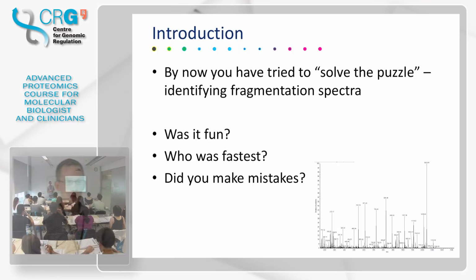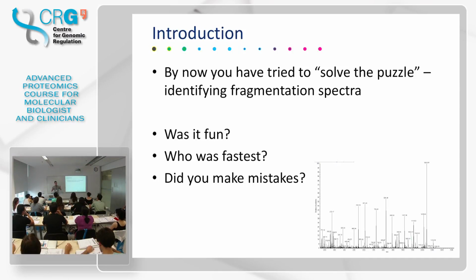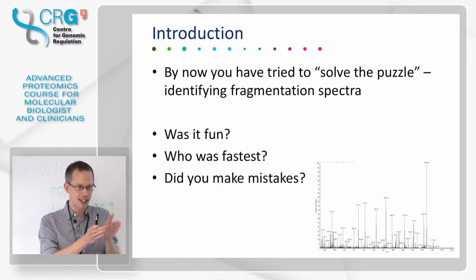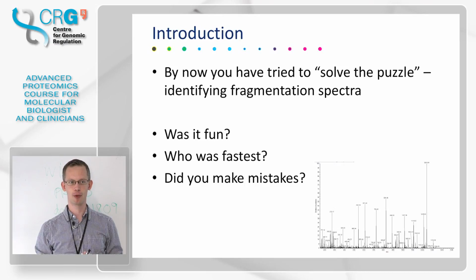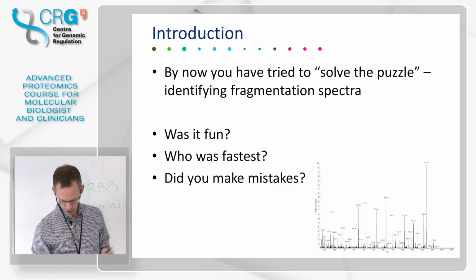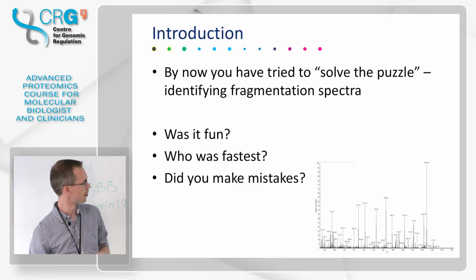So, just to recap what happened yesterday: you looked at some spectra, and you tried to figure out what these spectra are and what peptides they are. That's the very basic of shotgun proteomics, the bottom-up approach. What is the spectrum and what is the sequence that it really represents? That's what you'll learn more about today.